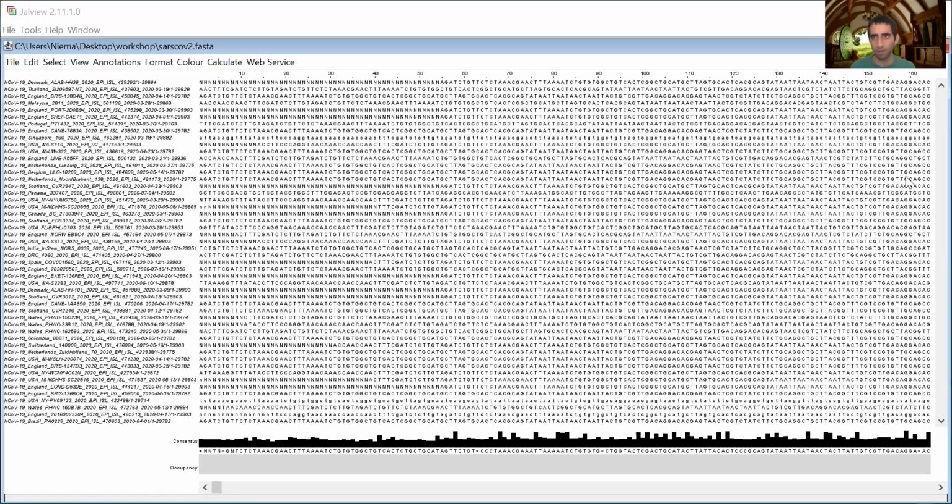For today's workshop, I'll be using an example subsampling of just 50 sequences to keep the data set size small. As you get bigger data sets, these analyses become much slower. So here I'm showing you the 50 sequences that I have. You'll notice that the sequences don't really seem to line up very well. They don't really seem to have any matches.